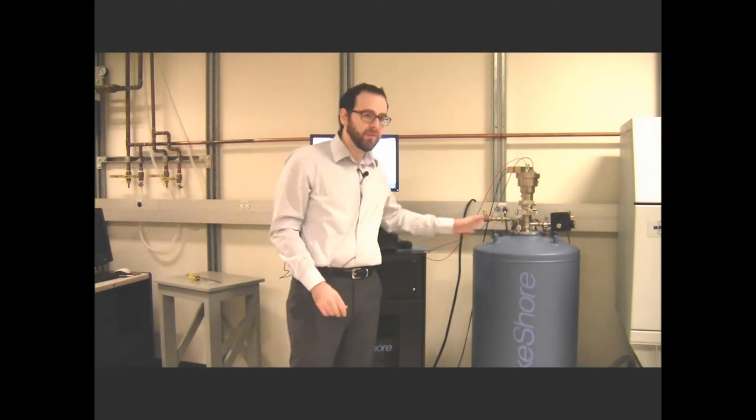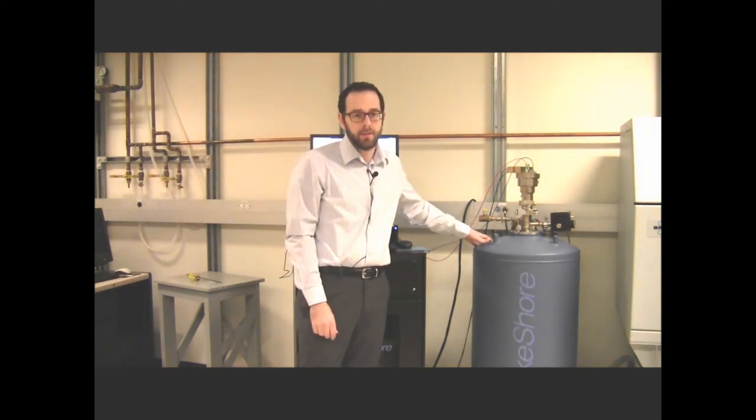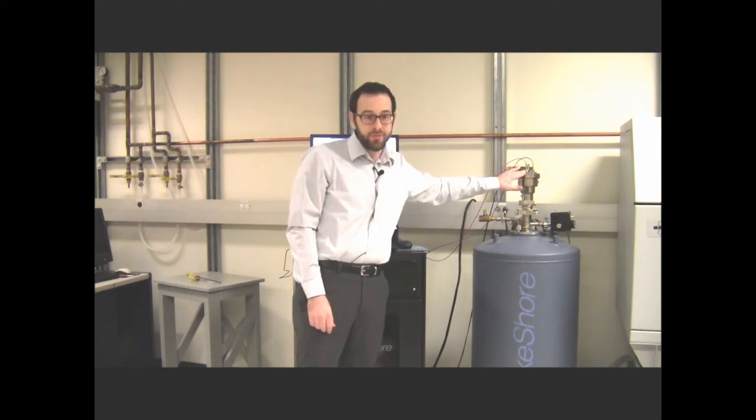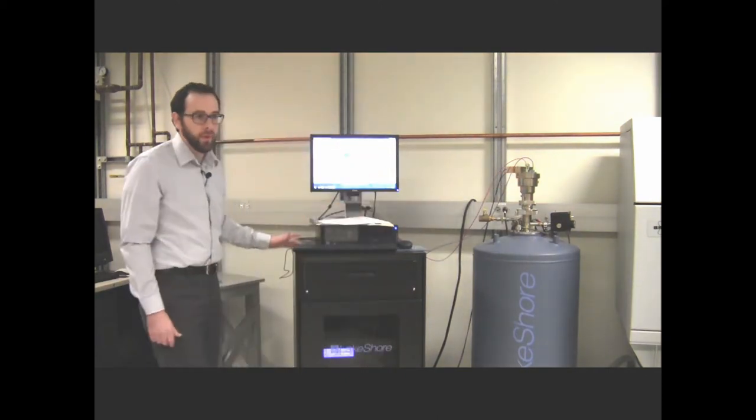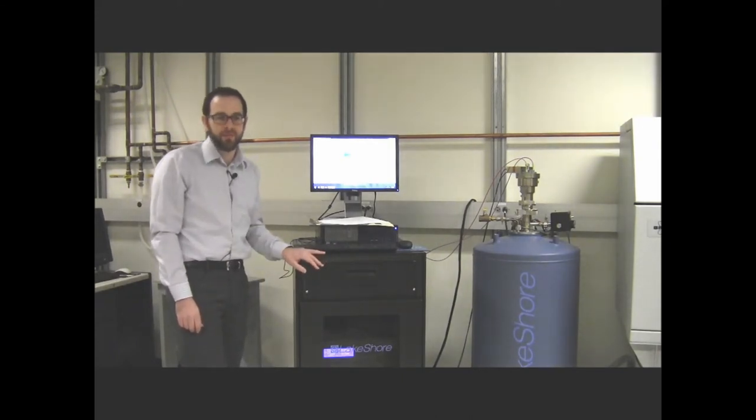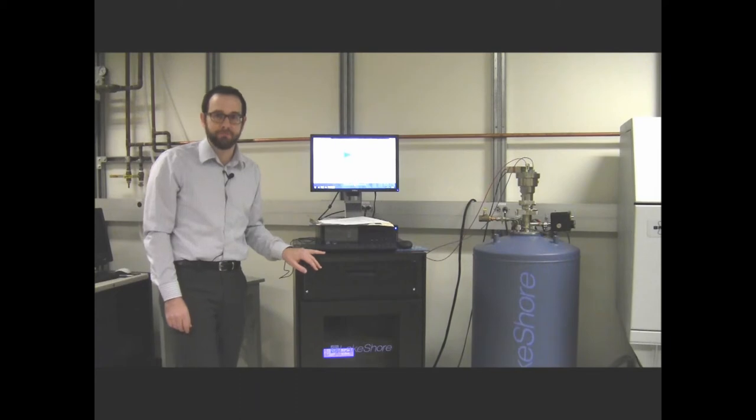The system consists of a nine tesla high magnetic field cryostat, a terahertz sample insert, and the console with software control of instrumentation to control all three of those parameters: the terahertz, the magnetic field, and temperature. In conventional terahertz measurements at cryogenic temperatures, steering mirrors and lenses are required to focus terahertz frequency light onto your sample to do your measurements.